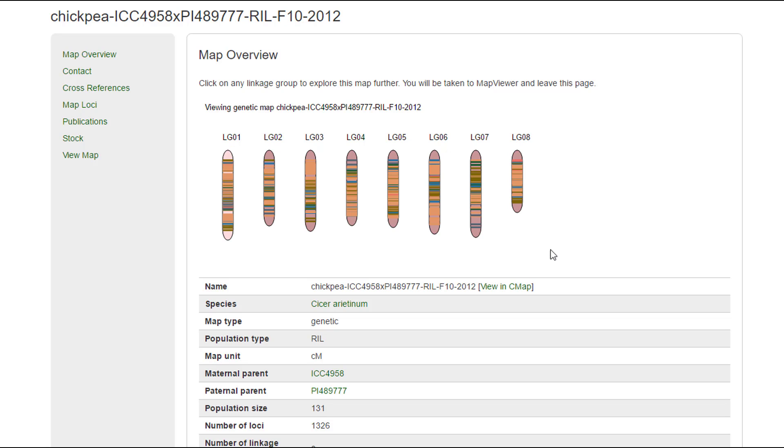To get more details, simply click on one of the linkage groups and it will open the Map Viewer window.